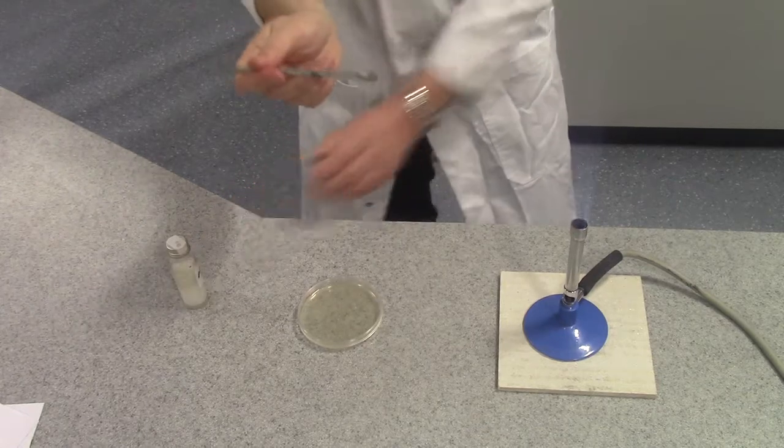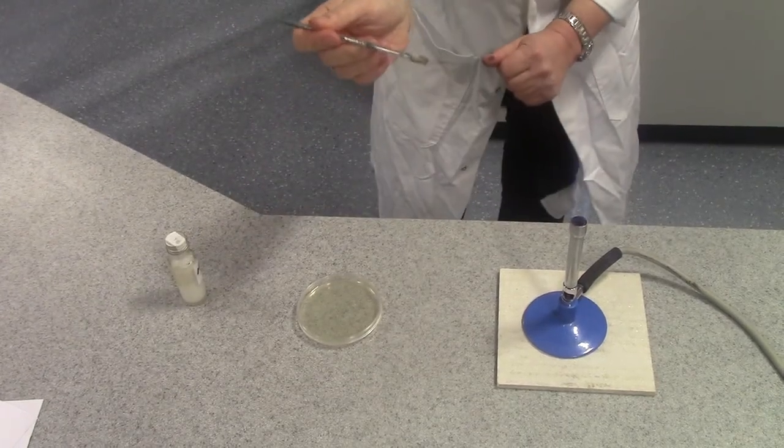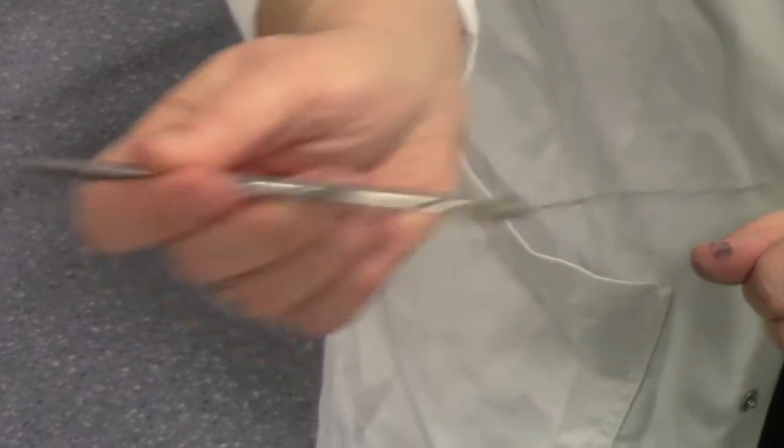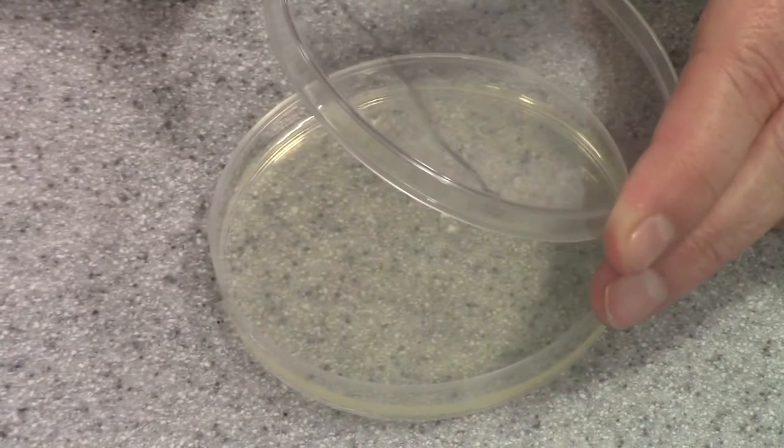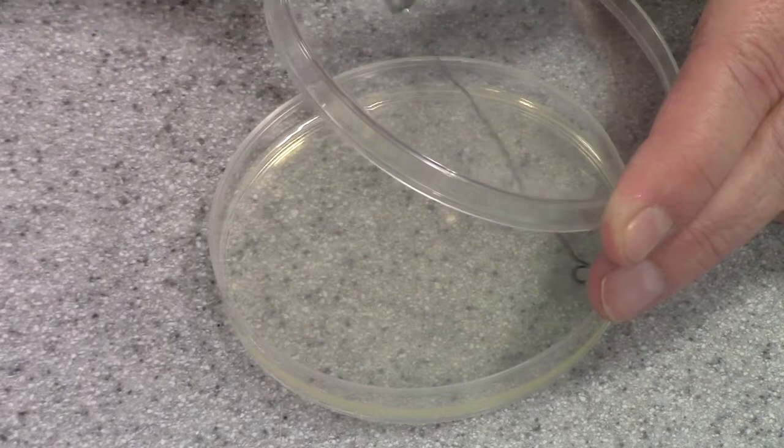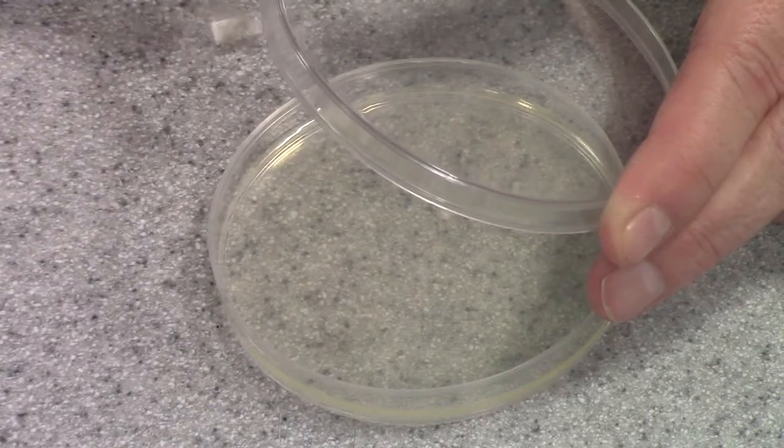We now have a drop of milk on the wire loop, which should contain millions of different types of bacteria, and we're now going to spread them on the plate in a special technique. Start by carefully lifting the lid, and then without pressing, just gently streak the wire loop across the plate side to side.